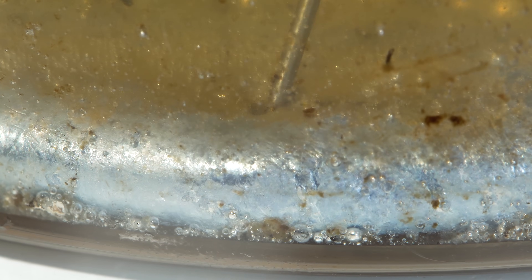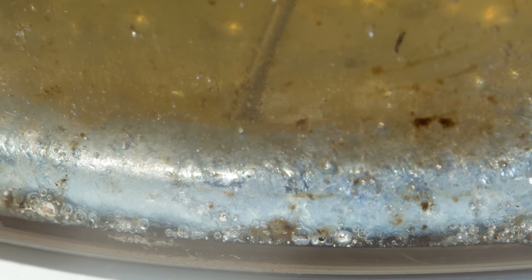Like the sodium-potassium alloy, the rubidium-cesium alloy is also liquid at room temperature and can be easily drawn into a syringe.